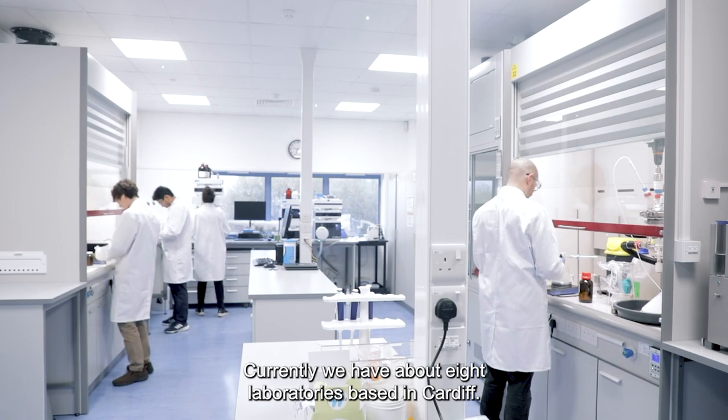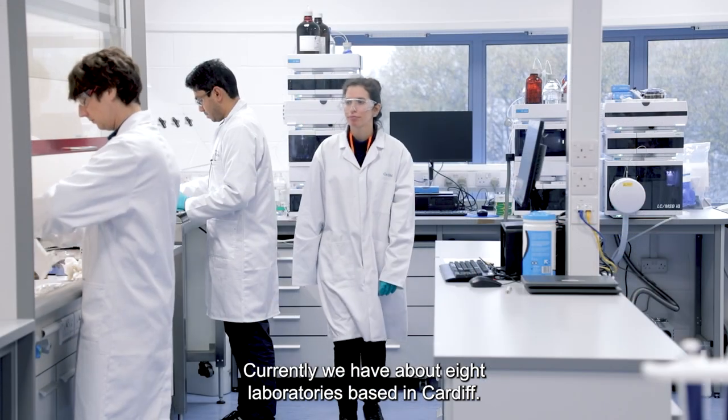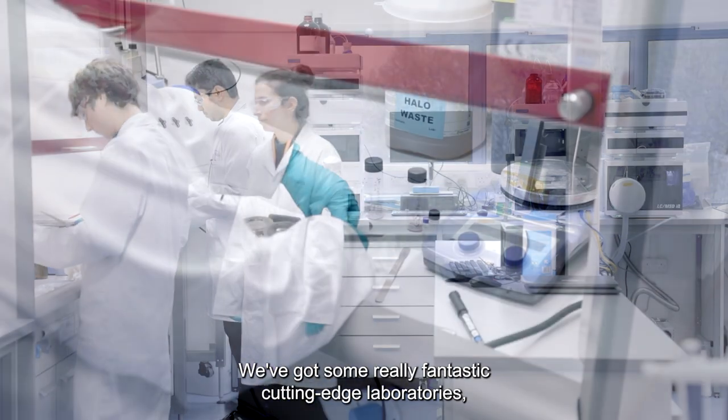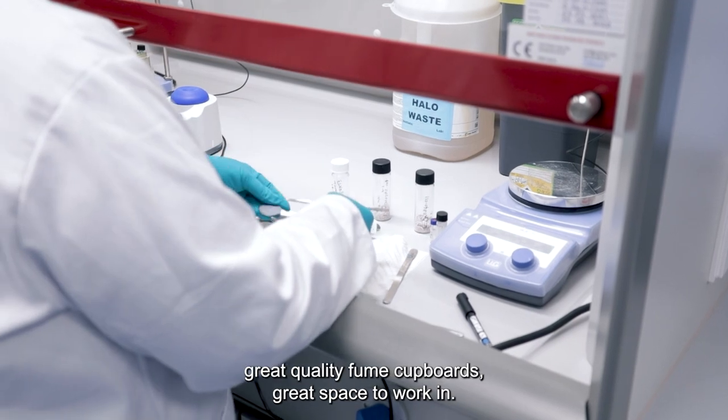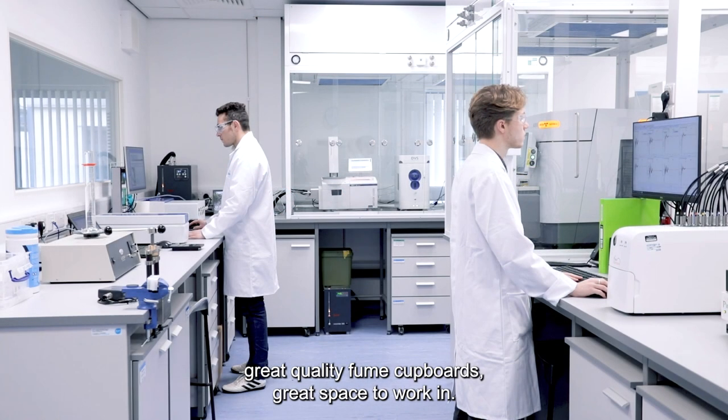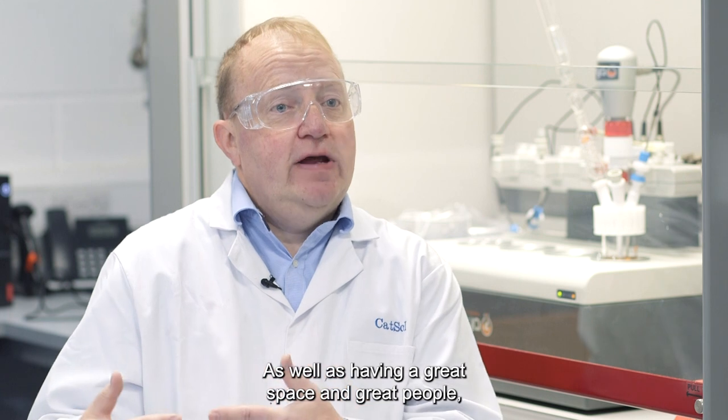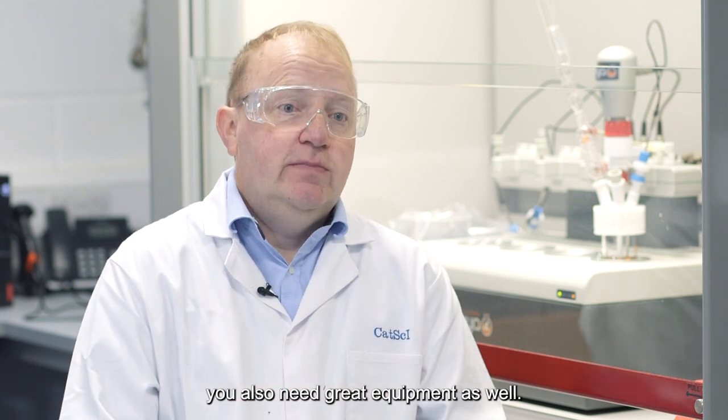Currently we have about eight laboratories based in Cardiff. We've got some really fantastic cutting-edge laboratories, great quality fume cupboards, great space to work in. As well as having great space and great people, you also need great equipment as well.